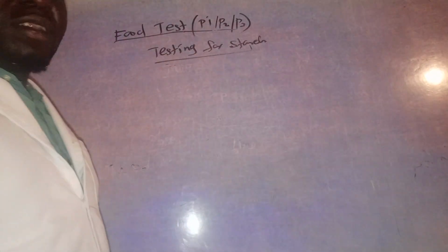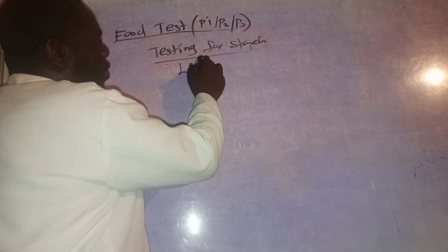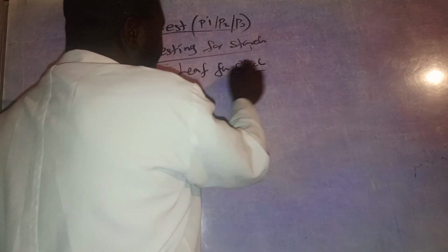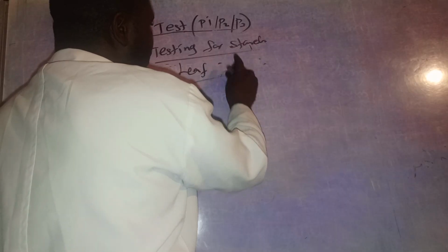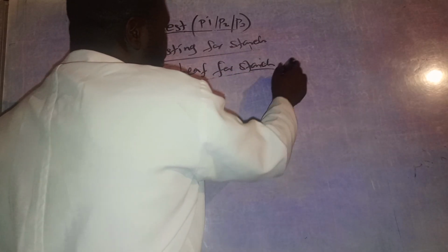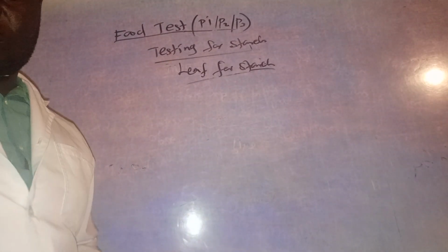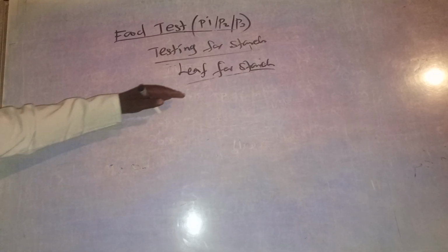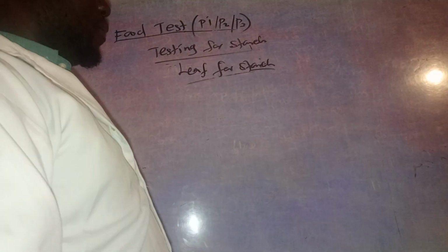Okay, so the next part is how to test a leaf for starch. For example, how can you carry out a test on a leaf for starch?